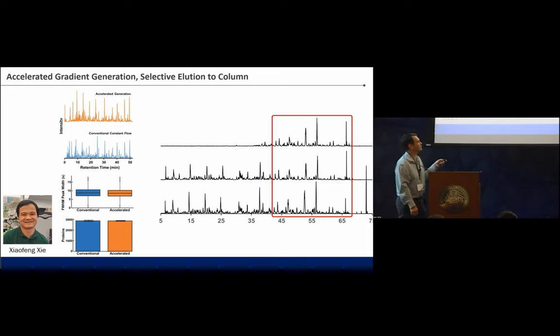Some faster mass spectrometers that may or may not be released at ASMS should help that approach a lot. And then the improved pair picking algorithm should help that a lot. In terms of co-isolation, yeah, maybe I'm not thinking on my feet very well, but it would definitely be something good to look at experimentally.